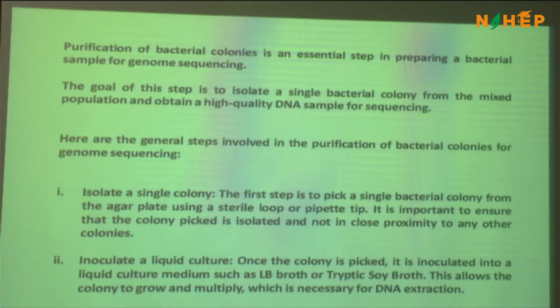Of course, the single colony isolation, even today, I would say, is going to be forever one of the finest techniques for purification of bacteria. Never ever underestimate that, right? You tell me how many of you can really bring single colonies in the third and fourth quarter of a quadrant streak? Yeah, if you are doing it, I'm very grateful, but many times people fail, right? The third and fourth quarter will still have the trails of lines without any isolated colonies, right?